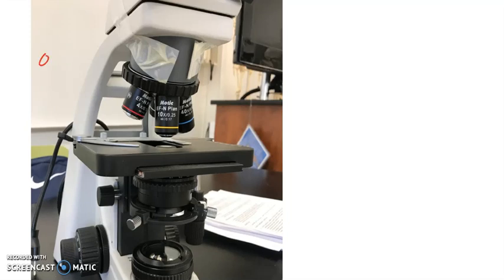Again, these are your objectives. Again, this here is your stage. And these clips that secure the slide, we call them stage clips. So clips right there.